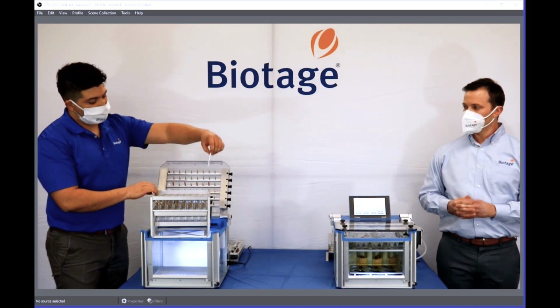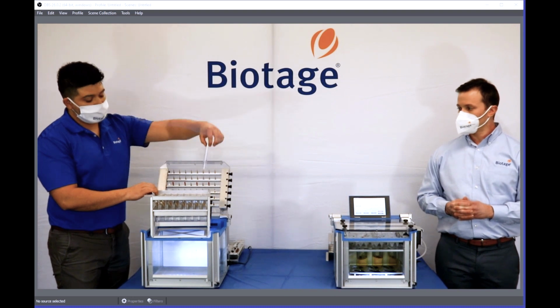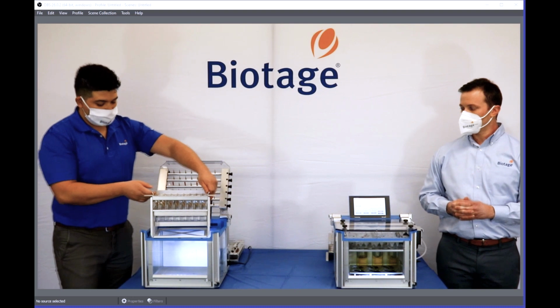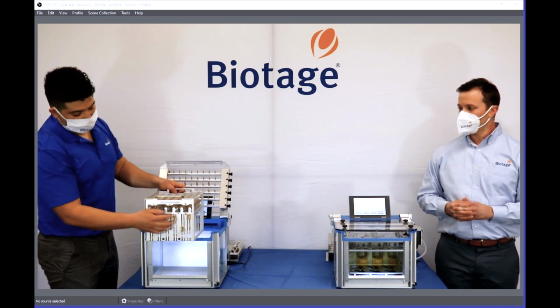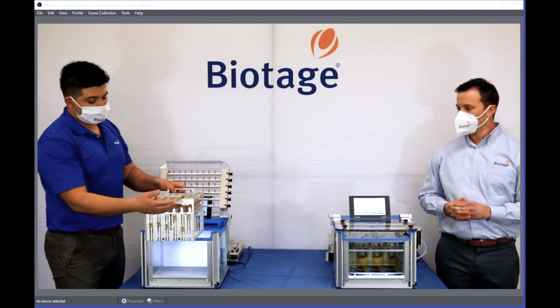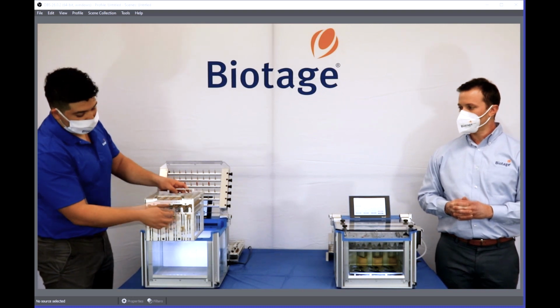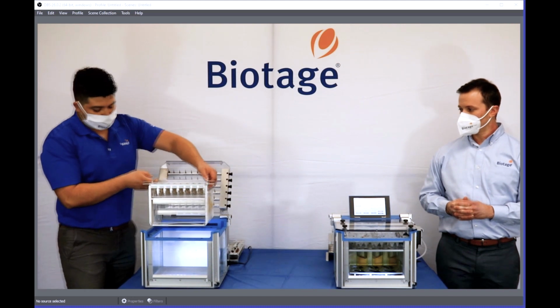As you can see, currently I have a 12 by 75 test tube in here, and a 16 by 125. Similar to our 24 position, to adjust this, we slide the rail to the bottom of our culture tube or our test tube, so it fits securely and snug right along this rail here. And you can see that okay. And then it's ready for evaporation.